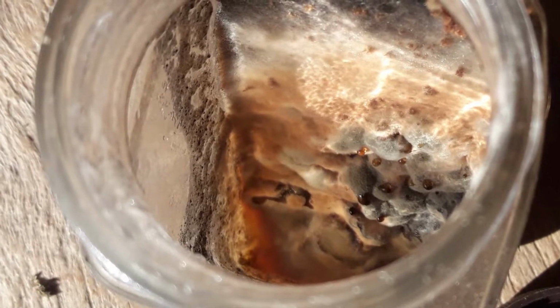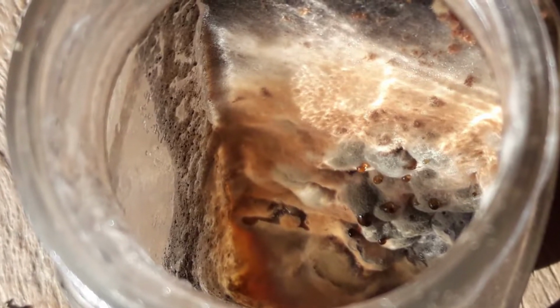It is very hard to keep things absolutely aseptic, and it takes a bit of trial and error before we get our hand right for the process. In a well equipped lab, contamination control is much easier, but in the home setting, we must be triple careful. Fungi and bacteria are microorganisms that reproduce asexually. It means that they don't need a partner to produce offspring.